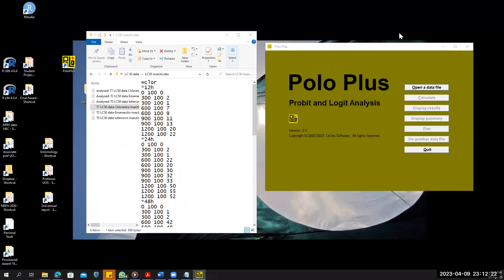I will let you know about the use of POLO Plus to calculate the LD50. The most important thing is how to enter the data. If you have this software, POLO Plus, just click on the software and it will open after clicking this tab.